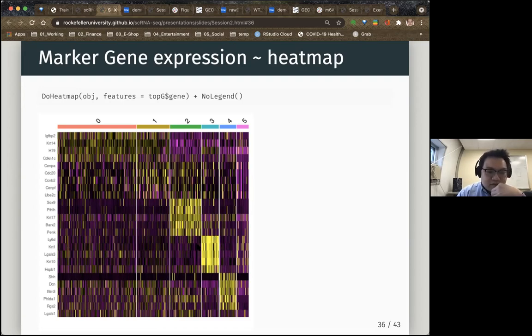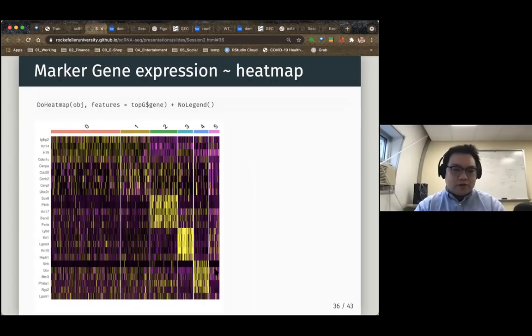It seems cluster 3 is epithelial cells, and cluster 2, I remember, is SHH activating cells. Oh, no, sorry. It's SOX9 activating cells, and this one is another lineage. It is Sonic Hedgehog expressing cells in cluster 4.